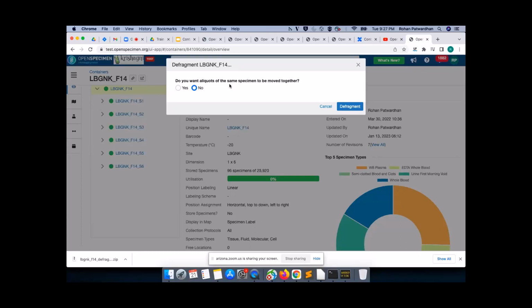So I just wanted to make sure that, besides keeping aliquots from the same specimen together, it's doing a simple compression so that I can keep my first visits together and my more recent visits together and things like that. Yeah, the way we collapse things now, you could think of it as everything stays in order and we just collapse it straight without any reordering. It's just collapsing the absent values. Okay, okay.